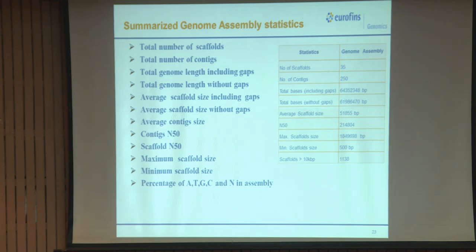It should be somewhere around 45 MB with 5 MB or 10 MB of gaps. That is a comfortable genome assembly to be published, right. So, this is what we see. Then the average scaffold size: the greater it is, the better the assembly will be. You will have maximum scaffolds of 21 kb or more. We also reach 1, 2, 3 MB as well. So, that is a very good assembly wherein you have a maximum size of 3 MB in de novo.